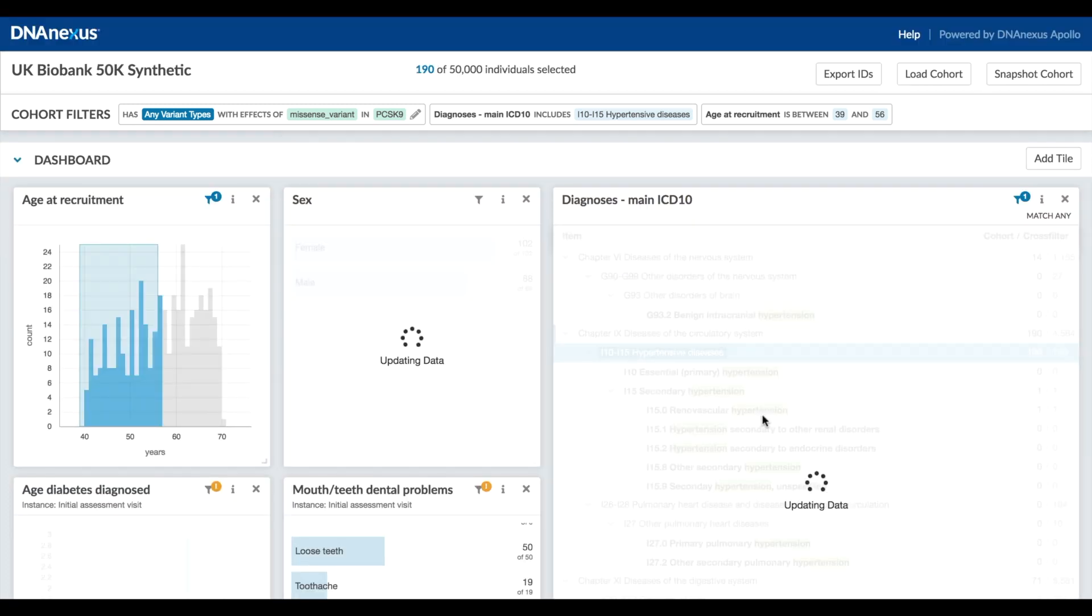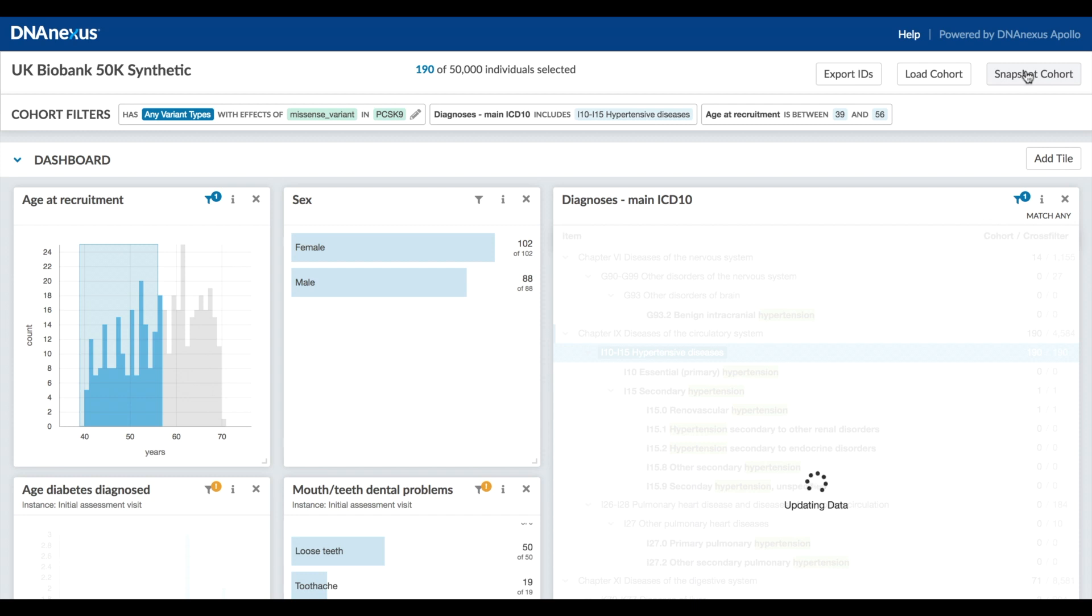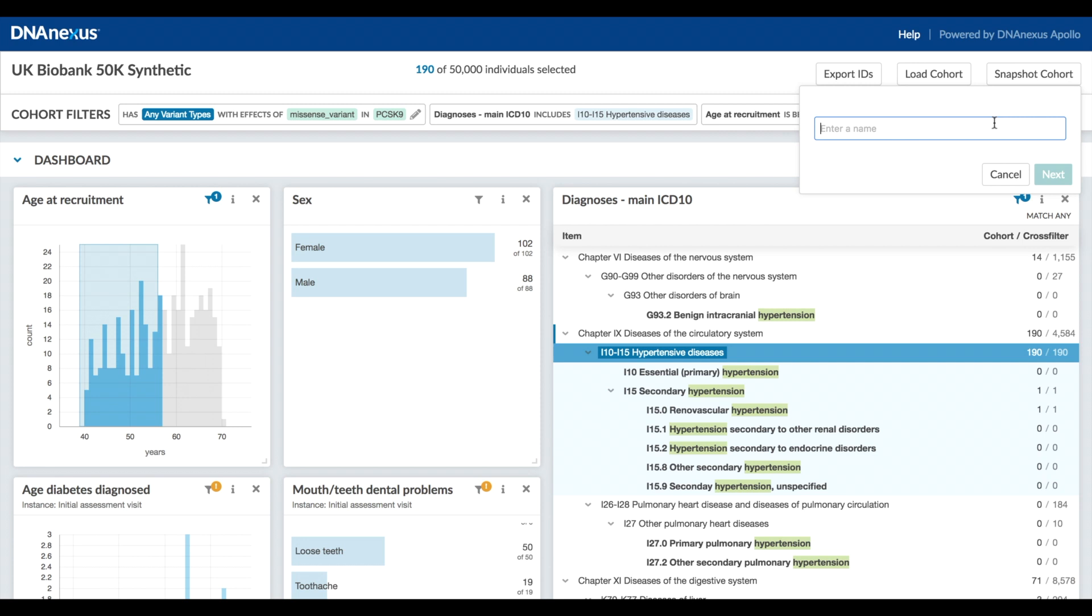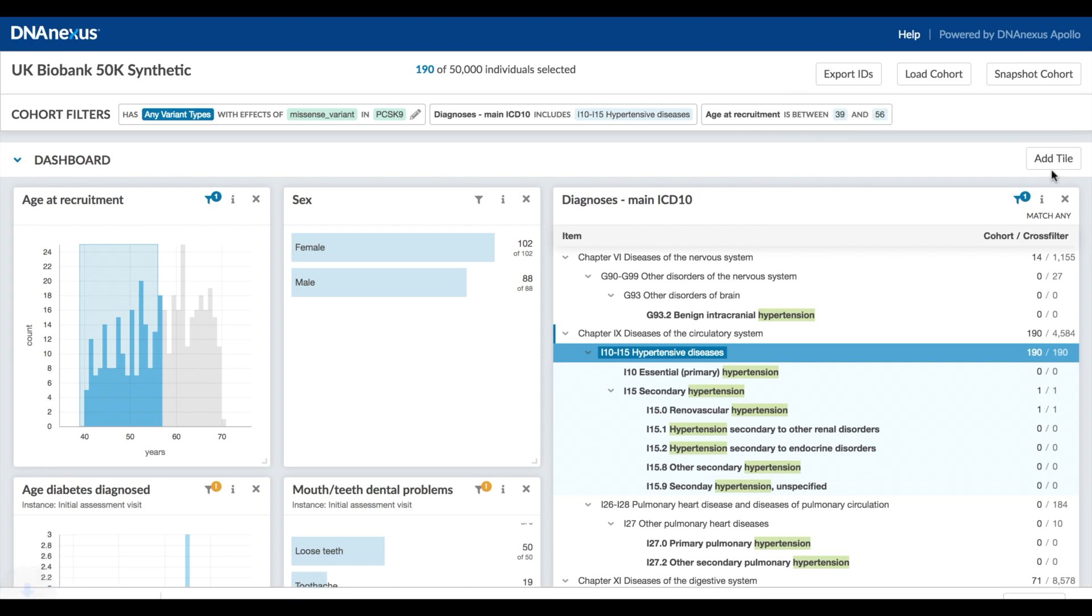At this point you may want to share your cohort with a collaborator or take a snapshot for your own use. The snapshot cohort button captures everything about the current dashboard that you need to replicate it. I'll give it a file name, example, then to restore a session from this saved file you would use the load cohort dialog.